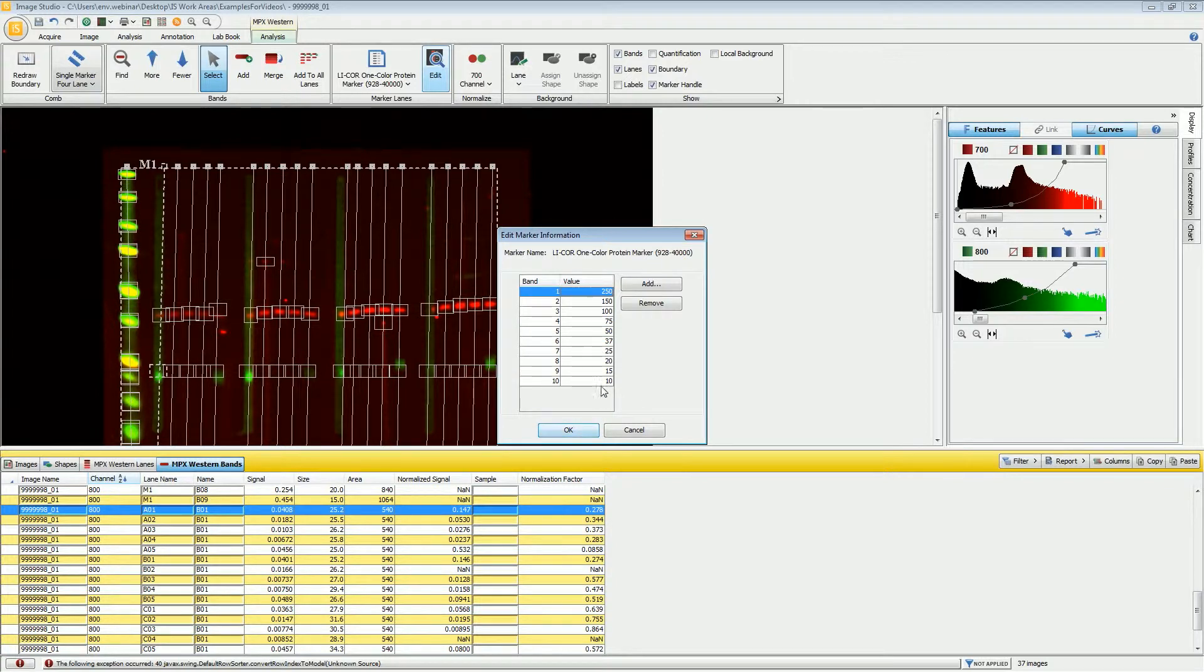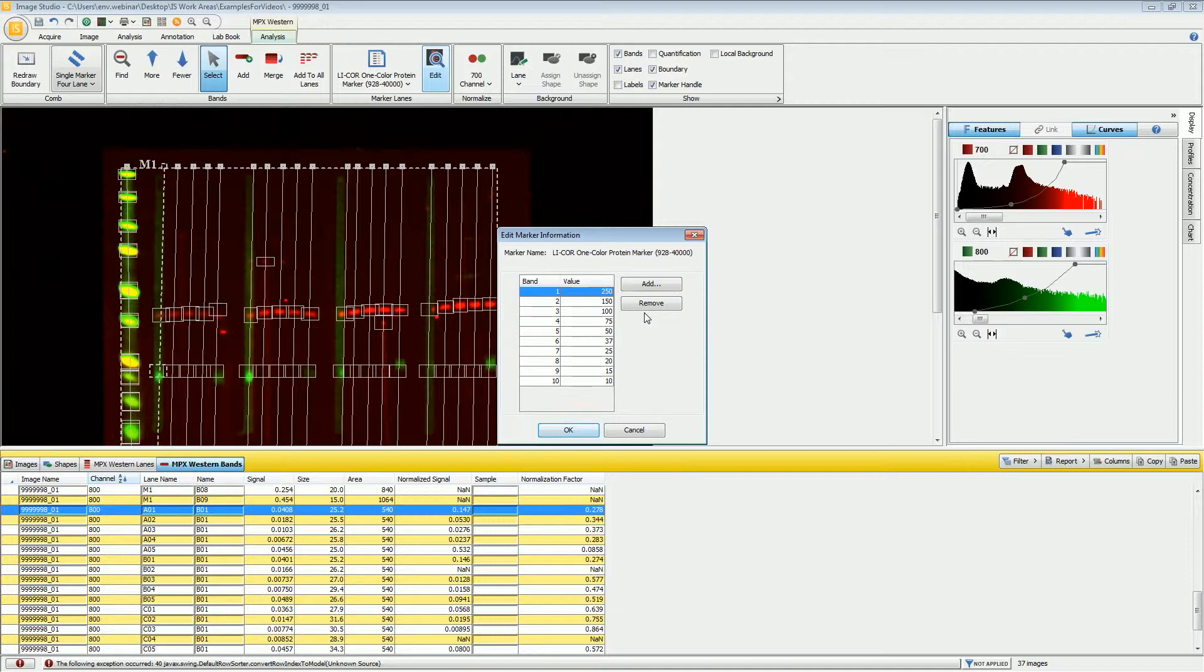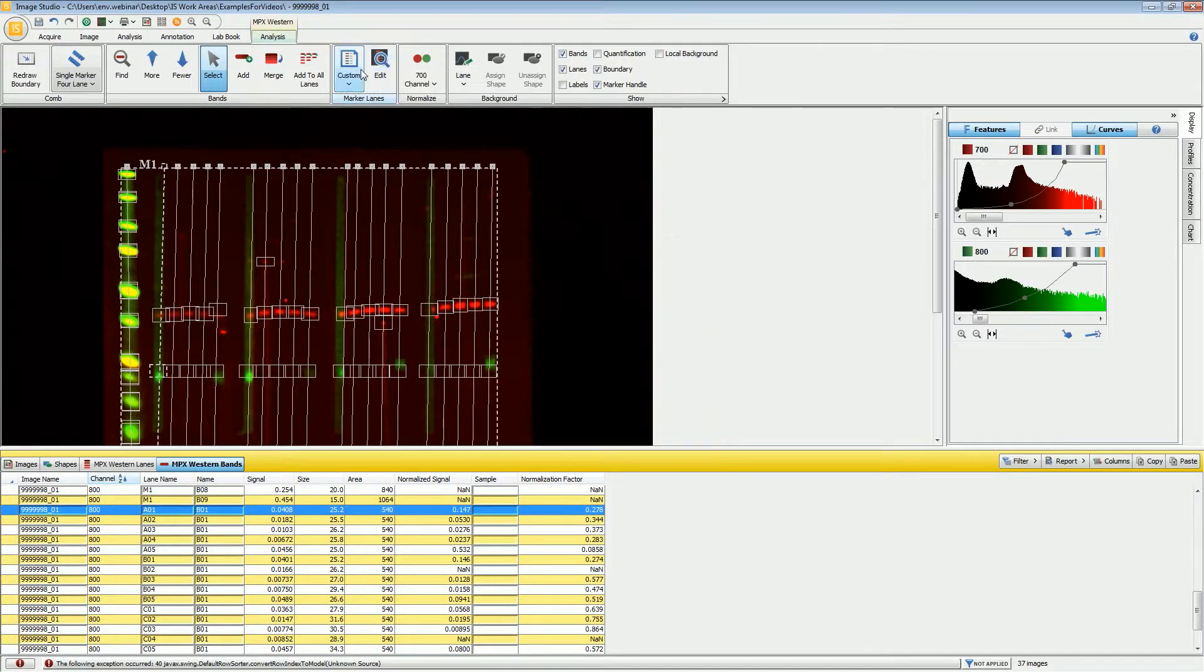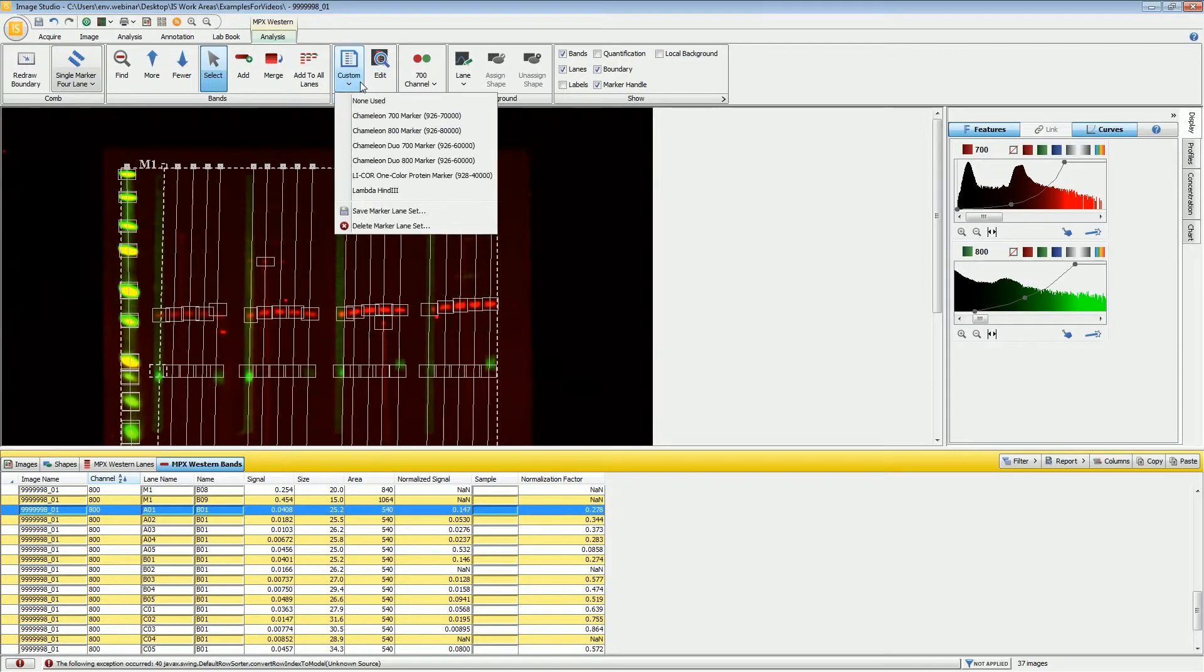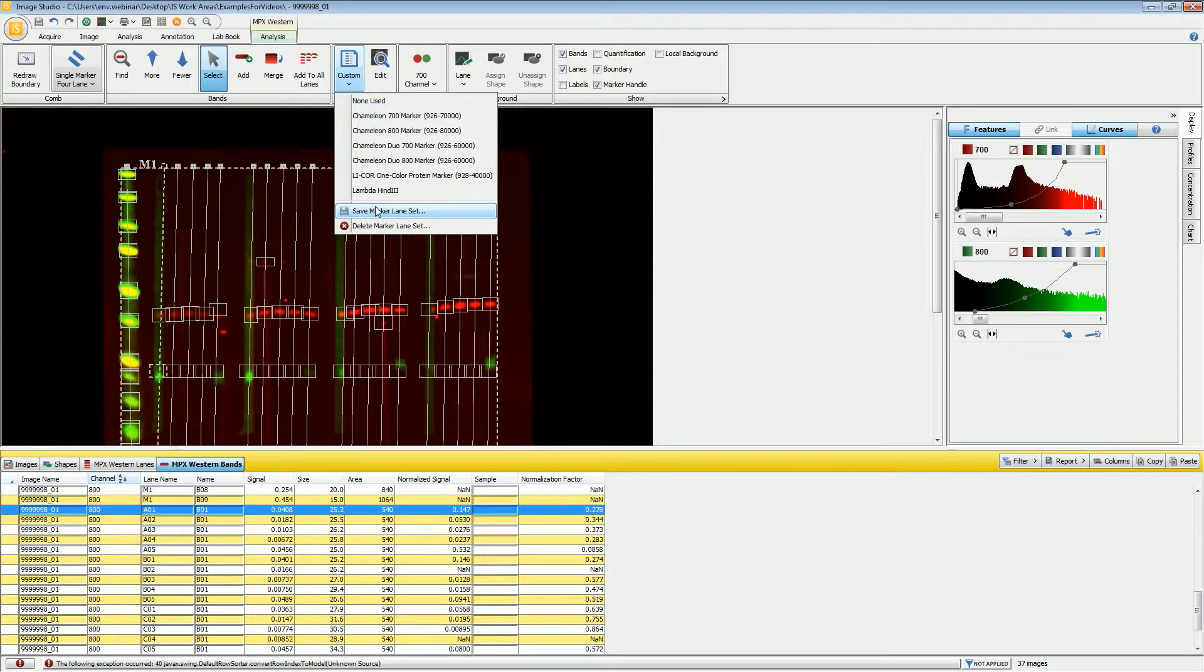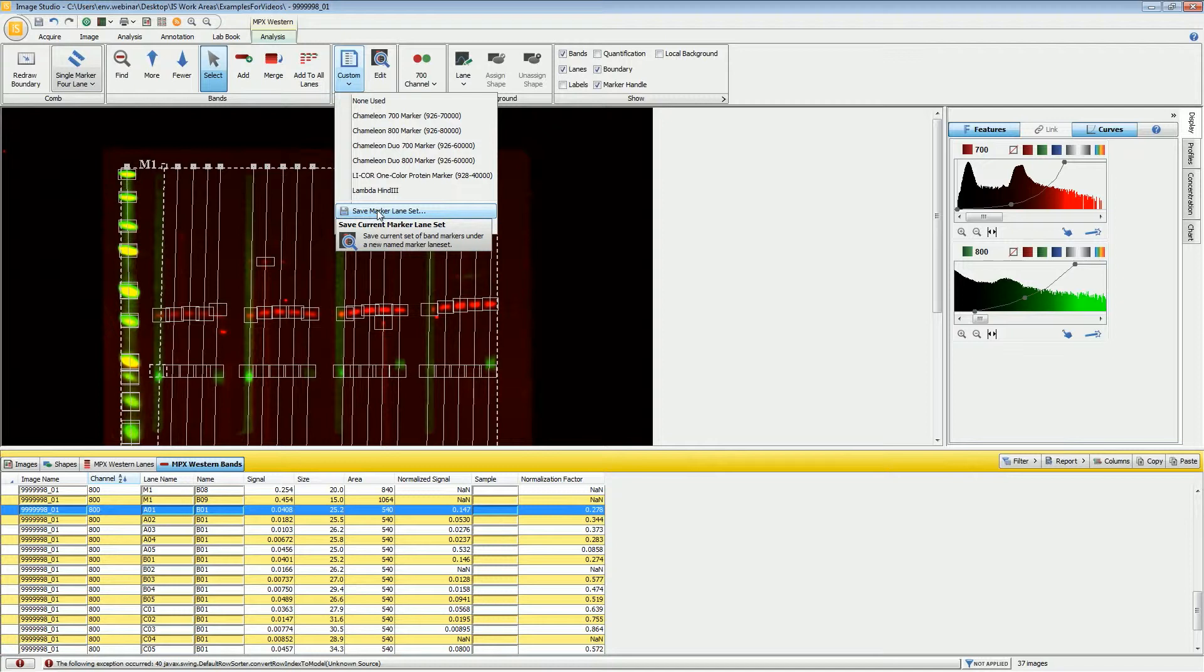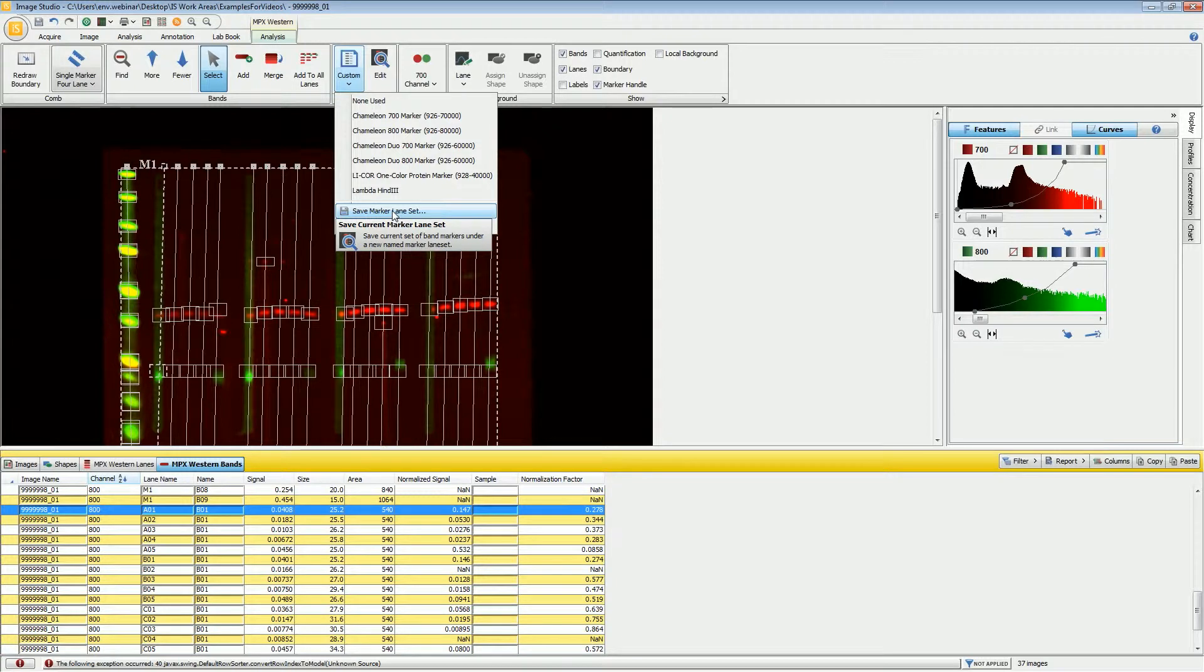If you do need to make some modifications, you can add or remove band markers from this. Anytime that you change one of these defaults, it then becomes a custom marker set. If you want to save that for future use, if you're reusing the same type of markers or if you're using the marker from a different company, you can save that marker set as one of your defaults.